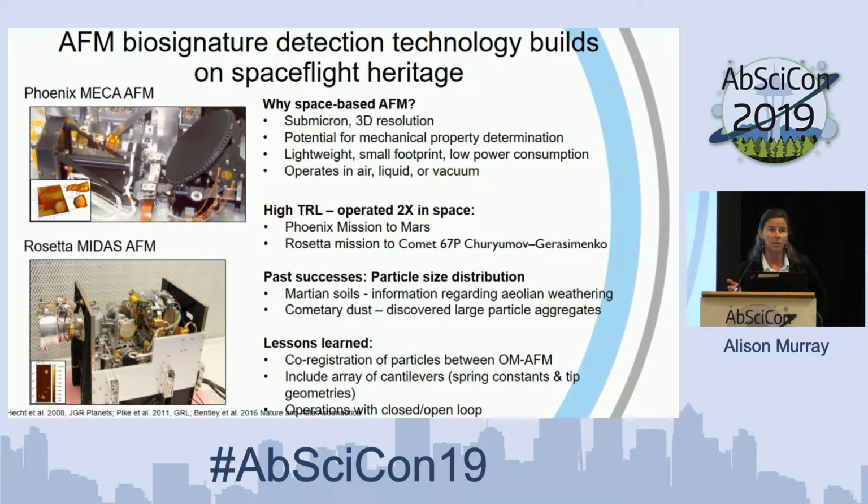Mark Bentley wrote a paper post the Rosetta mission that was really on lessons learned from operating AFMs in space, which we have adopted into the design going forward and thinking about ANTONIE. Some of these are co-registering an optical microscope image with the atomic force microscope image, including an array of cantilevers that have different spring constants and different tip morphologies, and then being able to operate the instrument both in open and closed loop formats, which was required on the Rosetta mission.